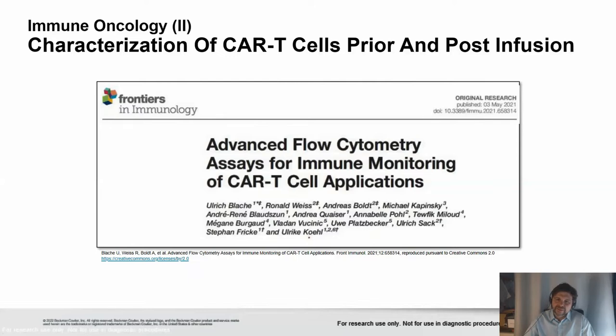And here I would like to present a paper that looks at CAR T cells as they are produced, so CAR T cell products, but also on the fate of CAR T cells post-infusion. So what happens to those CAR T cells once they are back in the patient? And for this purpose, the group developed immune monitoring antibody panels to monitor CAR T cells.